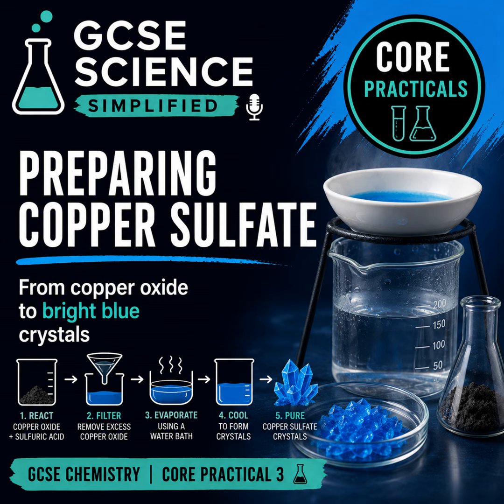Step 4. We need to turn this solution into crystals. Here's the transformation. You take the copper sulfate solution and gently heat it using a water bath. Why a water bath? Why not direct heating using a Bunsen? Because a water bath gives a controlled, gentle heating. The direct flame of a Bunsen would be too hot. Water would evaporate too quickly and the crystals don't form properly.